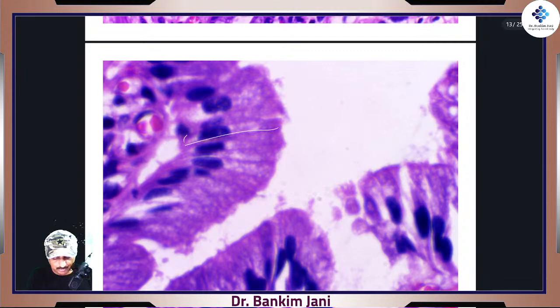Such a long columnar cell. Non-ciliated columnar epithelium, right? There are no cilia over here, right? These are big ones, all with elongated nuclei, right? See, every cell is like a masterpiece in itself, right? Removing the lining so that you can keep these images.